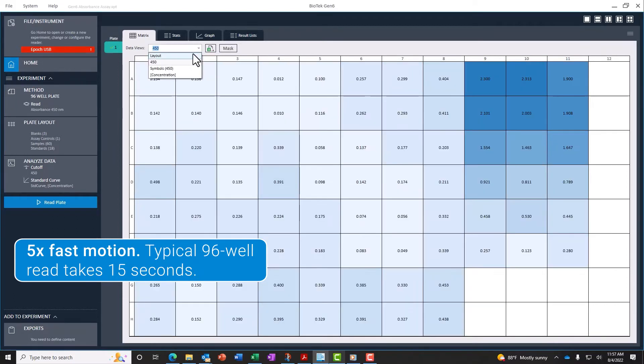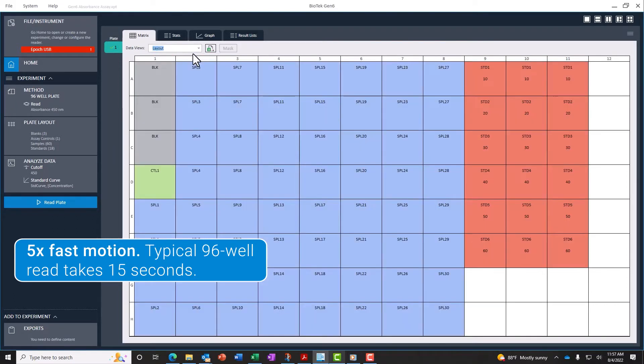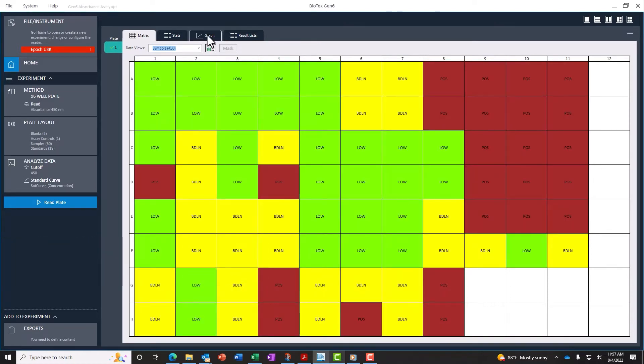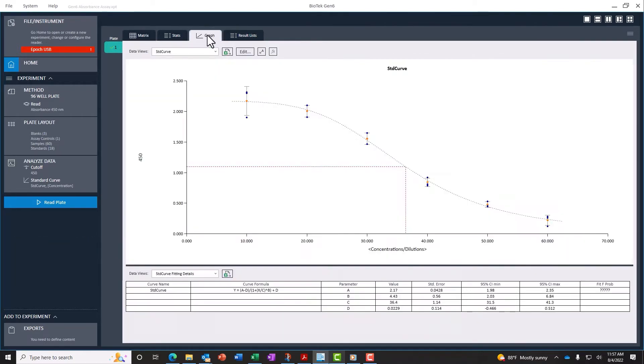Results are easily visualized as they are read. Data visualizations can be customized to view a range of calculated results, including standard and dose-response curves.